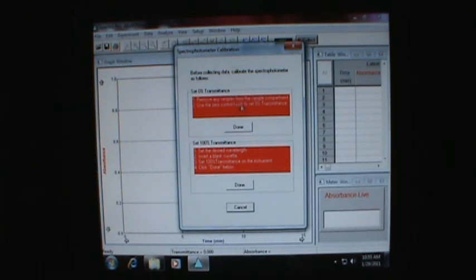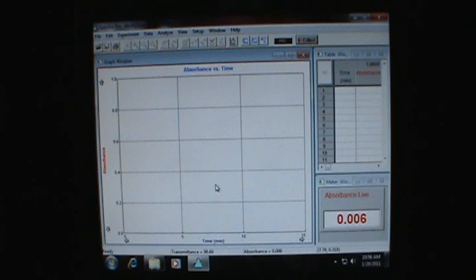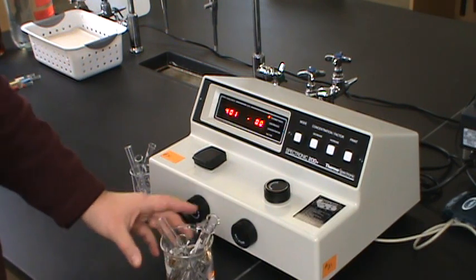Now we're into calibration. We already did the zero percent, so we'll do done on that. Wavelength is set. Let's grab a blank cuvette, get some water in it, into the instrument. Now I can adjust my hundred percent. That's done. So we can click done. Now we're ready to go. The computer's all set up.